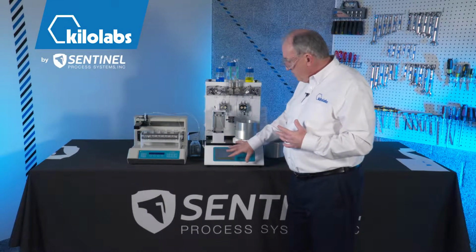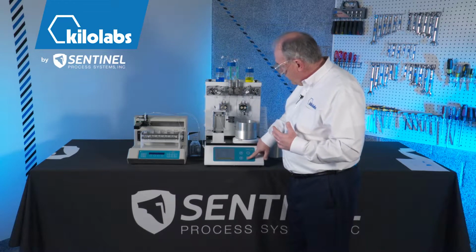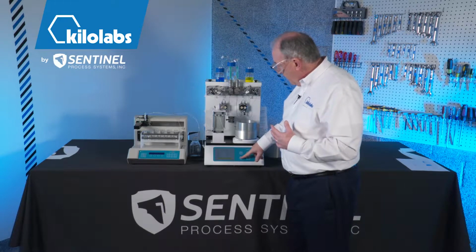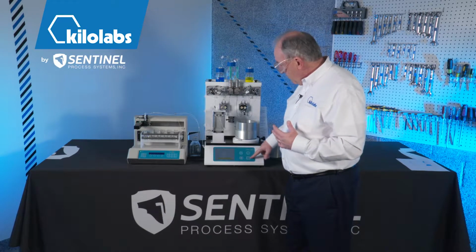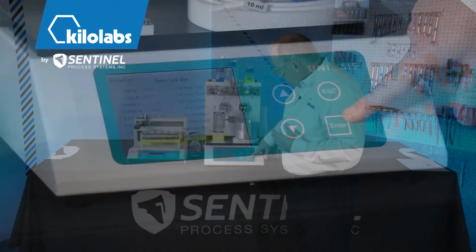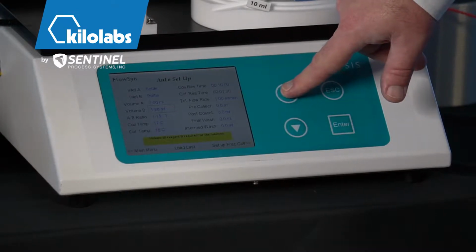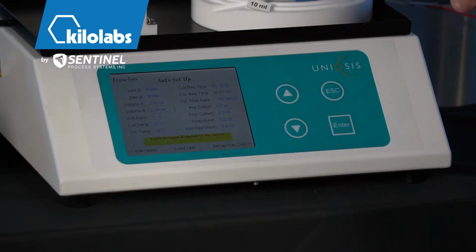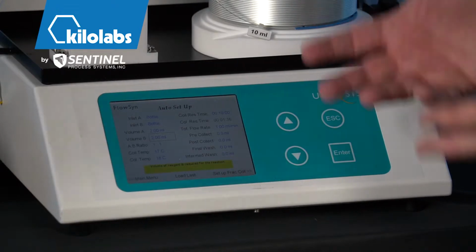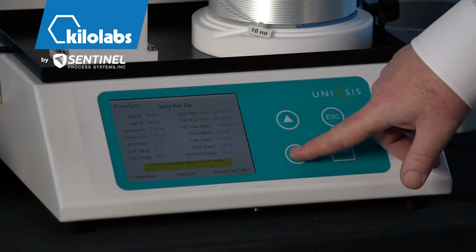So anyway, let's go through the rest of the automatic setup screen. I'm feeding out of bottles, not out of loops. So that would be the option here if we're feeding out of these intermediate loops that I said are on the high pressure side. The volume of reagents is here that I want to commit to each experiment. So what I'm going to do is set these, again these are arbitrary, to 2 ml for each reagent. The reason I'm doing that is because this coil is 10 ml and I'm committing 4 ml per reaction. So when we actually run this, we'll see that 4 ml go through the whole system and be collected by the fraction collector. But let me go through the rest of it.